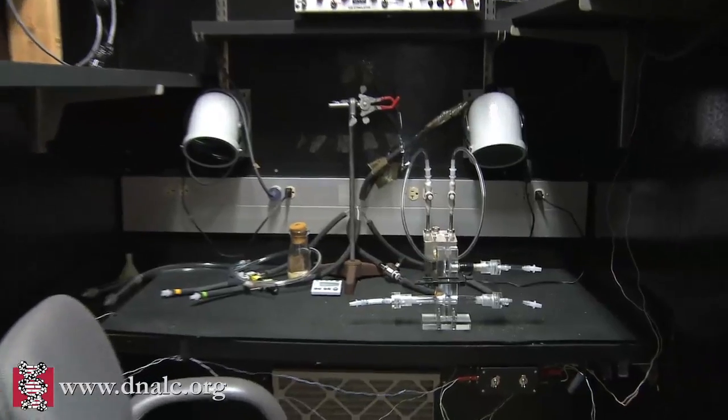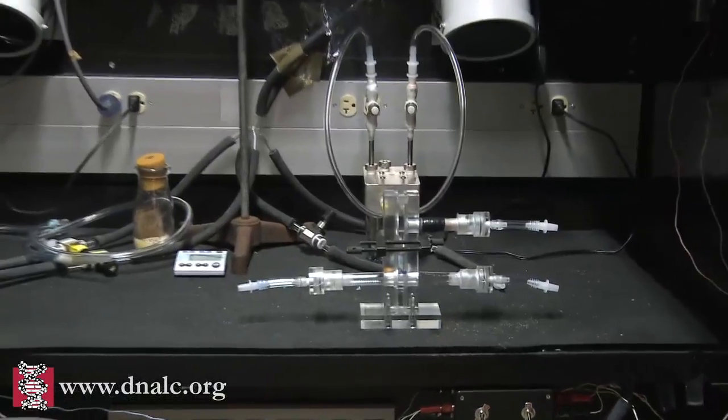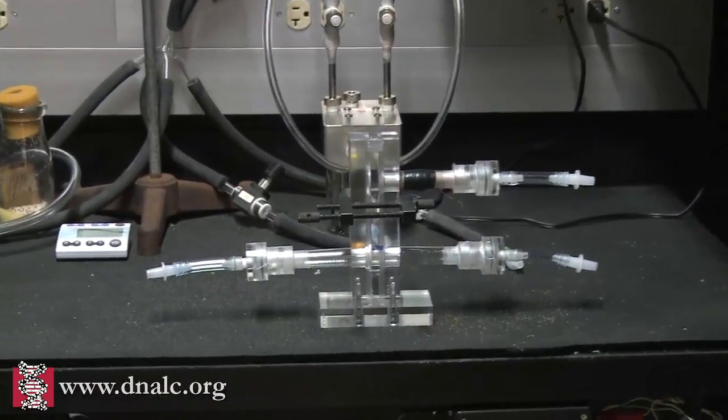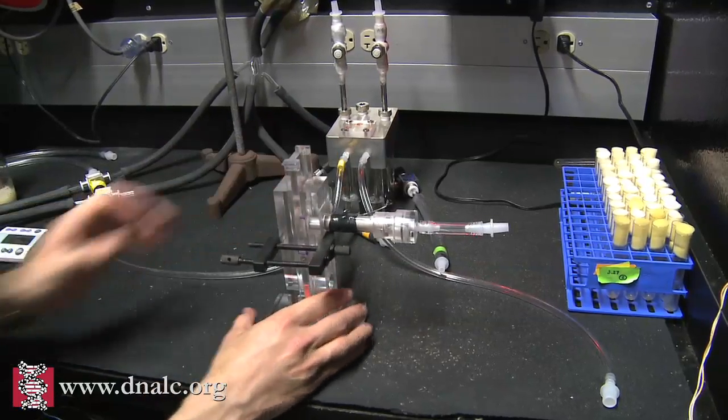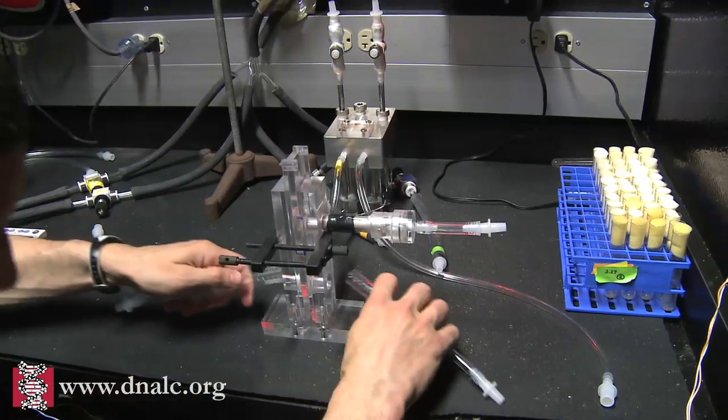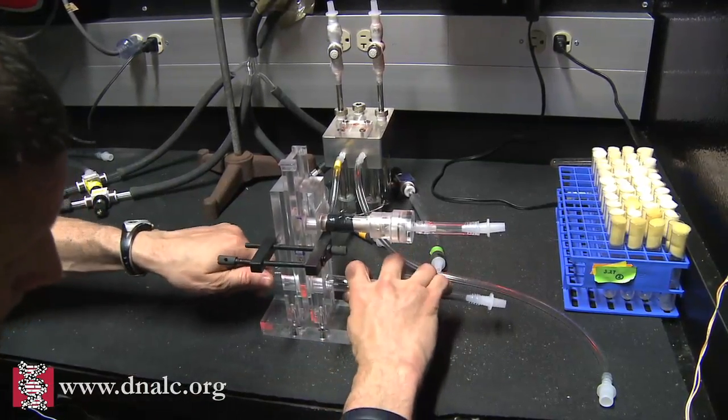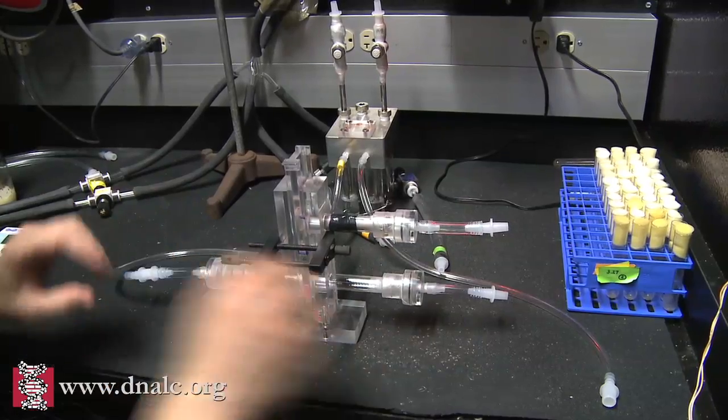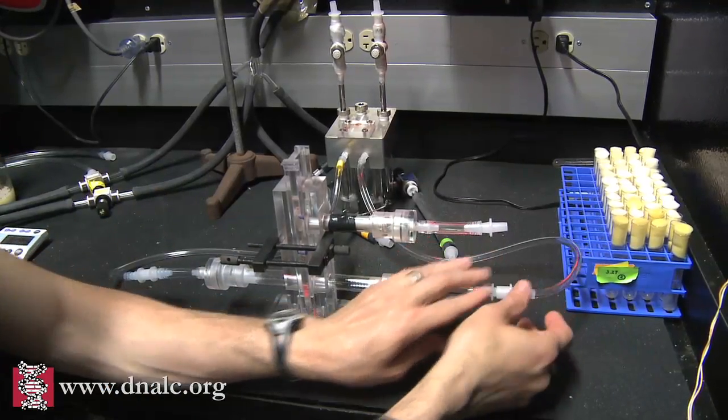So this is a T-maze. This is where we train the flies to associate an odor with an electric shock. The top part of the machine is the training chamber, and the bottom part has the T-maze where we actually let the flies make a choice between two odors.